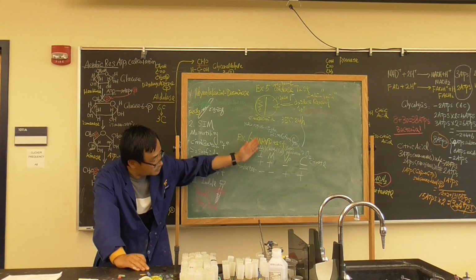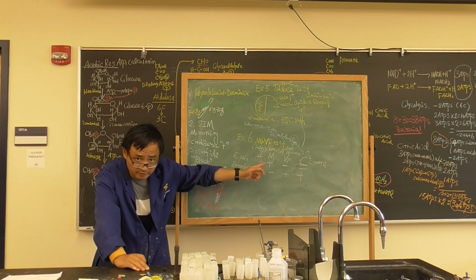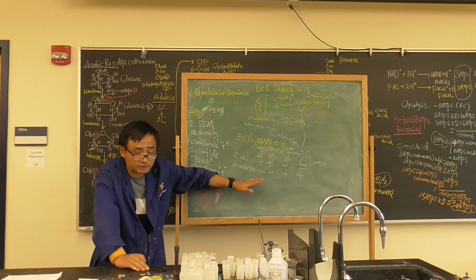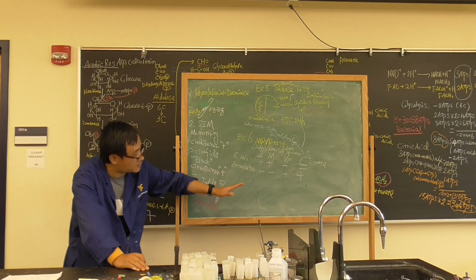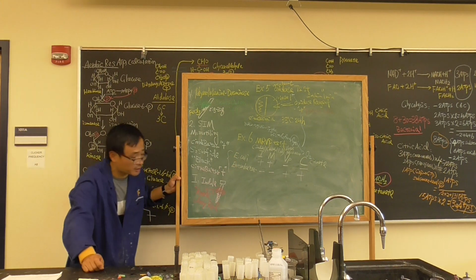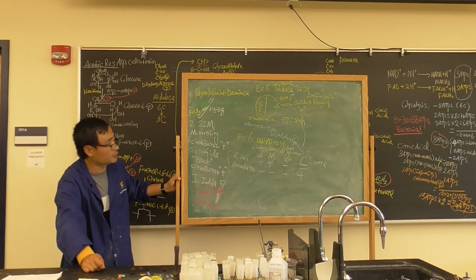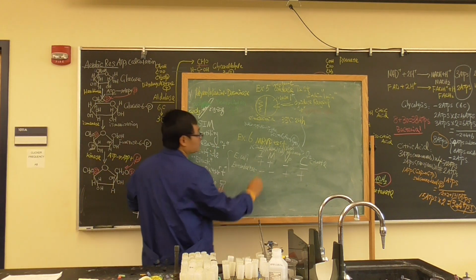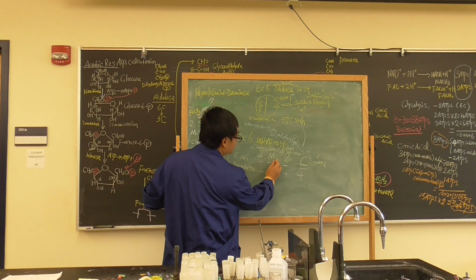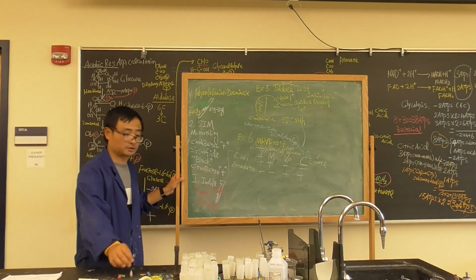They cut sticky ends, right? Does it look like that? Positive, positive, negative, negative, negative, negative, positive, positive. Because the results are so easy to remember, in the clinical area or in food microbiology they use it to differentiate E. coli and Enterobacter. We already did the indole test. We don't have to do the citrate test, it's the same thing. That's why today we do methyl red and the Voges-Proskauer test. Confirmation we'll do on Tuesday.